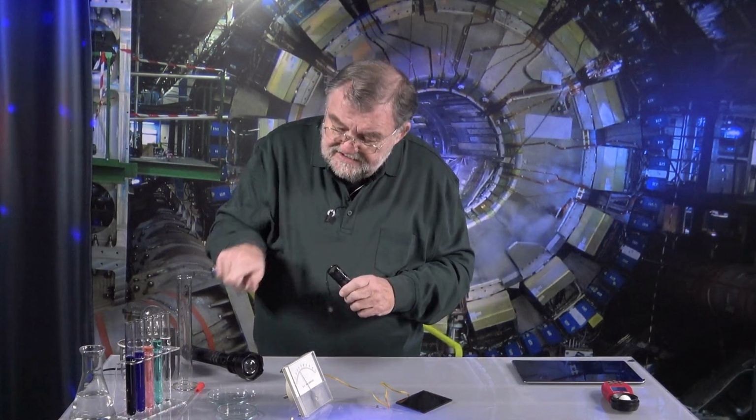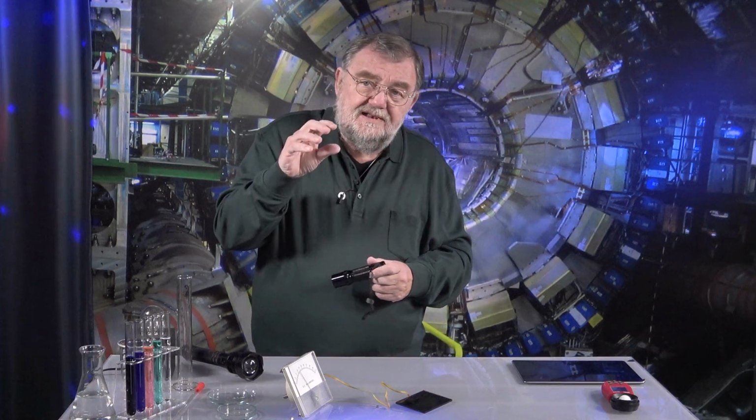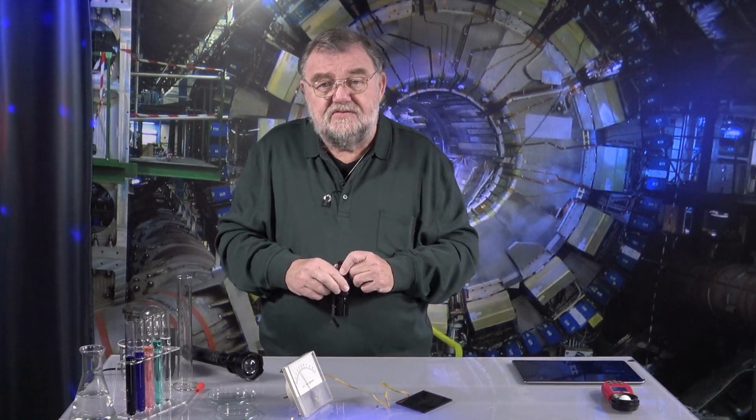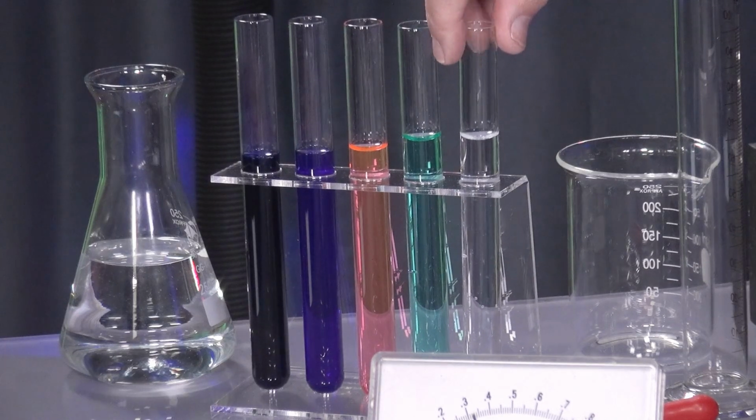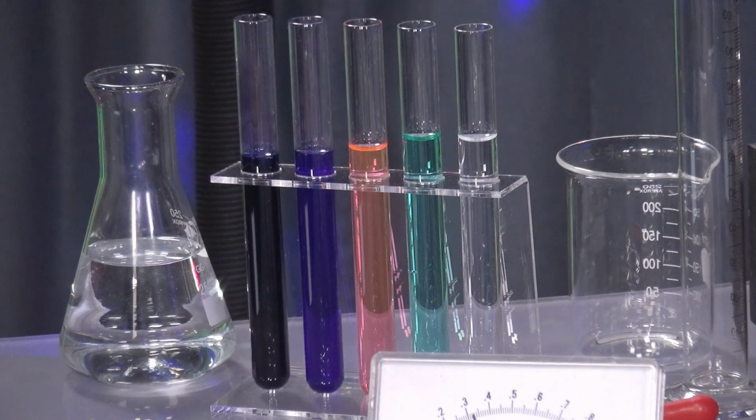But when I now use a measuring instrument which lights inside of the fluid, and the reflection is normally done at an angle of 90 degrees, I light into it, and then at an angle of 90 degrees I measure it with a photodiode. Light goes in at a certain wavelength, also with an LED, a light emitting diode, or also with 3 different wavelengths, 3 light emitting diodes and accordingly 3 receiving diodes. I can determine the cloudiness. How cloudy is it? You can simply say that here is totally cloudy, that nothing passes through, and that here, well, how cloudy it is we can't say with our eyes. And for this we need again our measuring instrument.